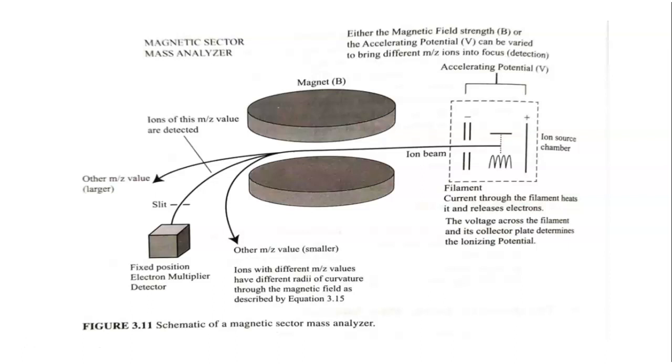And before jumping into this particular scheme, I would like to add one thing over here. See what is happening once your sample is ionized. You have seen the ionization techniques so far. You learned how your sample gets ionized and how it forms molecular ions. Now once your sample is ionized, the beam of ions has been accelerated by the electric field, and now it is going to pass into the mass analyzer. And what is a mass analyzer? It is a region of your mass spectrometer where your ions are getting separated as per their mass by charge ratio.